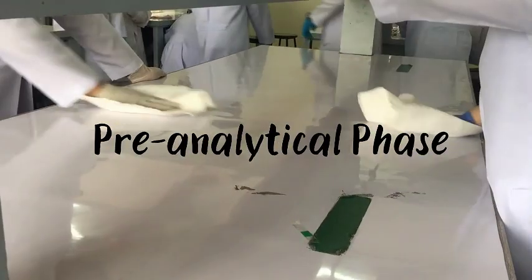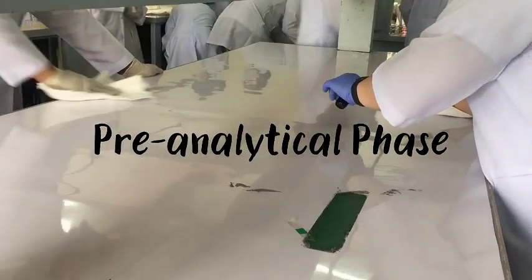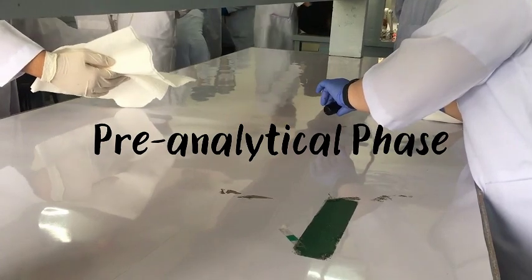Before starting, always make sure to disinfect and clean the area. The first test is the catalase test. Its principle is to identify the enzyme catalase, which converts 3% hydrogen peroxide into water and oxygen.